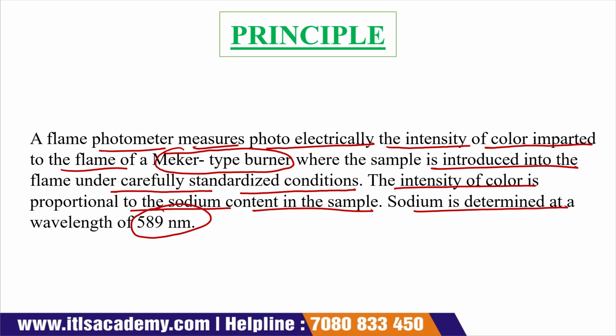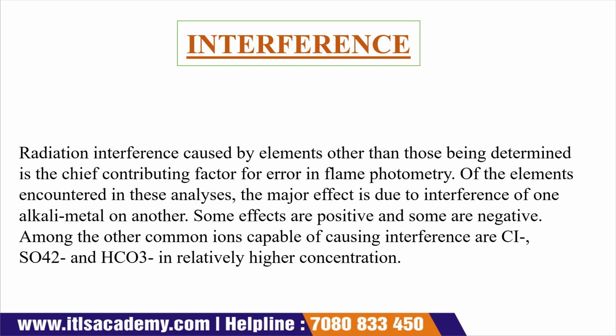Okay. Now, after the principle, come to the next slide. That is your interference. So, what is interference? Interference is what causes error. Suppose when we are performing the experiment, due to some material we don't get a correct result. It alters our result. That is called interference.